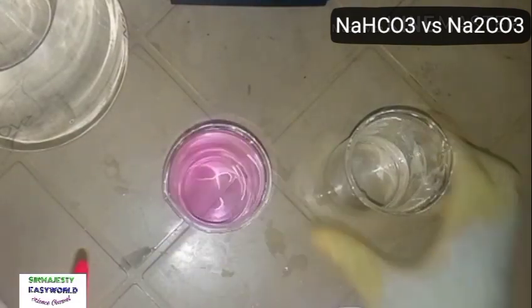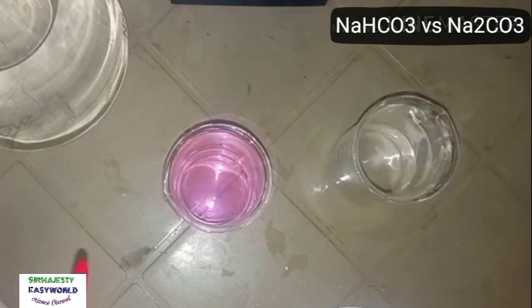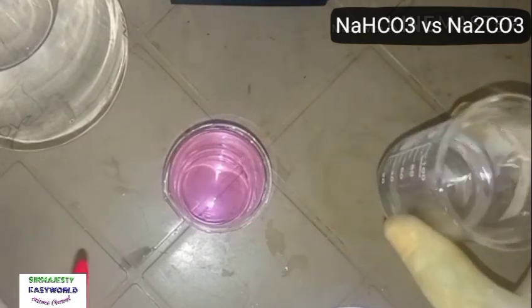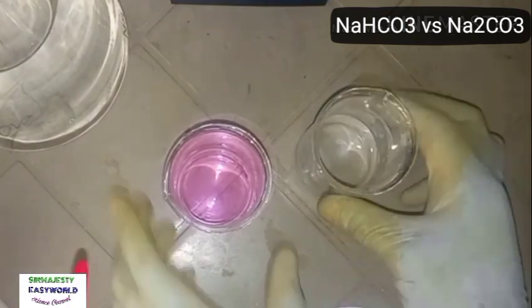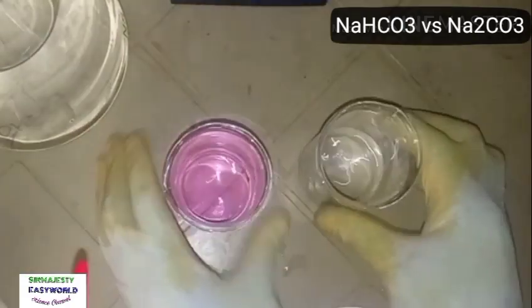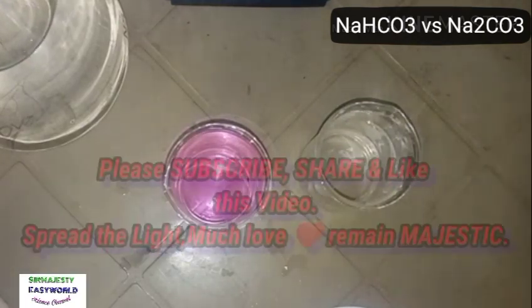There is no changing to pink here with the phenolphthalein, but with time the bicarbonate will turn pink. That's from my experience. You know, I do research. If I leave this tomorrow, both will turn pink, but this one will be more pinkish than this, which means you can use phenolphthalein. It is what I have now discovered that does the distinguishing very easily if you don't want to heat. But if you want to heat, that is very easy.